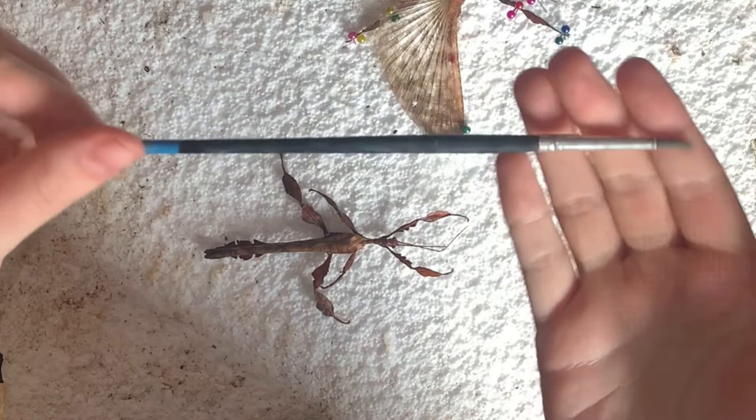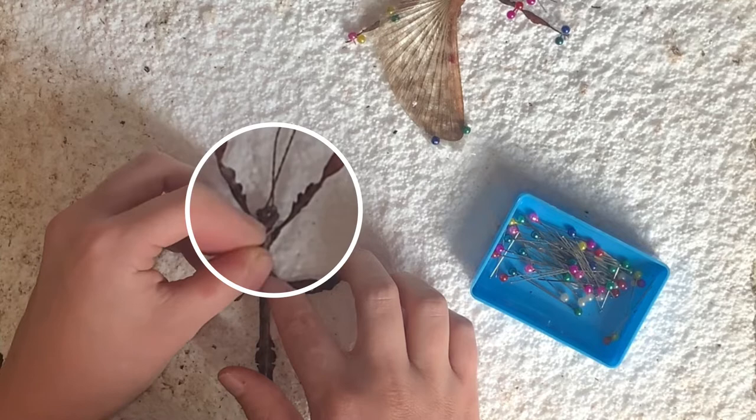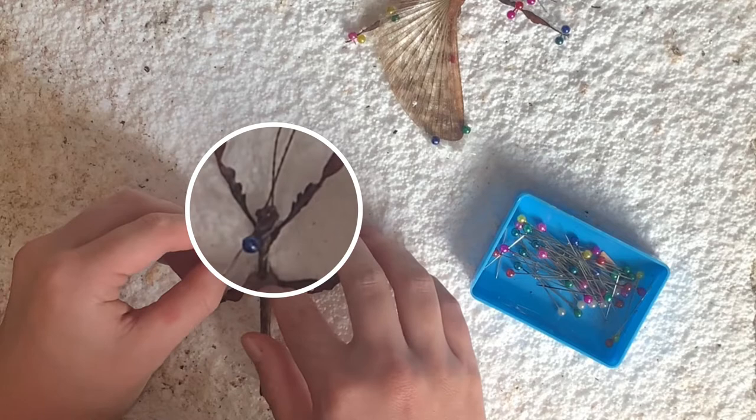To begin, start by placing a pin on each side of the stick insect's head to stabilize it. When you are pinning, it is important to remember that no pins should be going into the actual invertebrate, but rather around it.